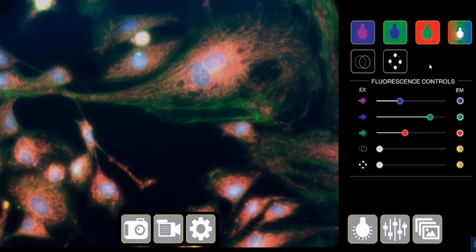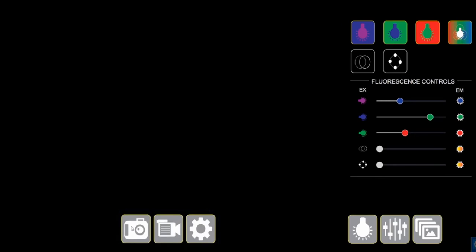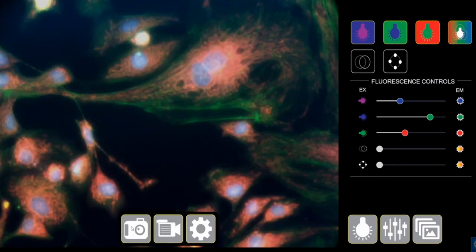You can choose to increase or decrease with the kind of dye that you're using and the kind of absorption you have on your sample. This is your snapshot button. You click here and there you go. I just took a snapshot of what I have on my screen.